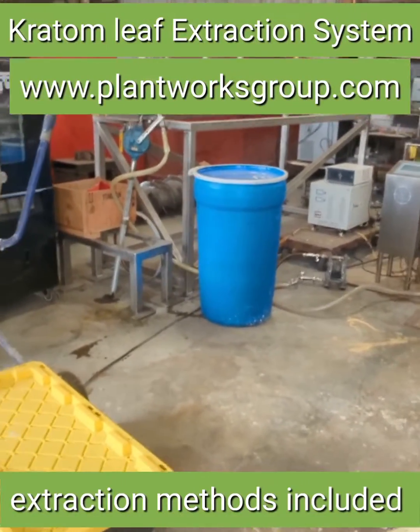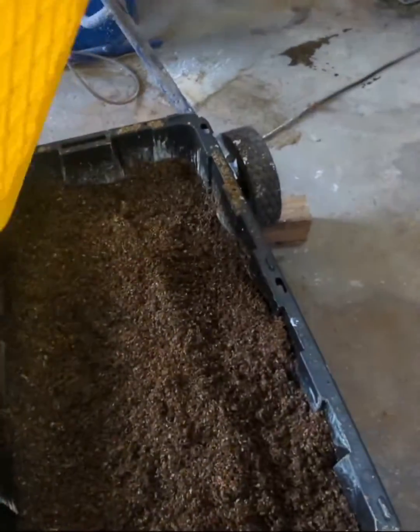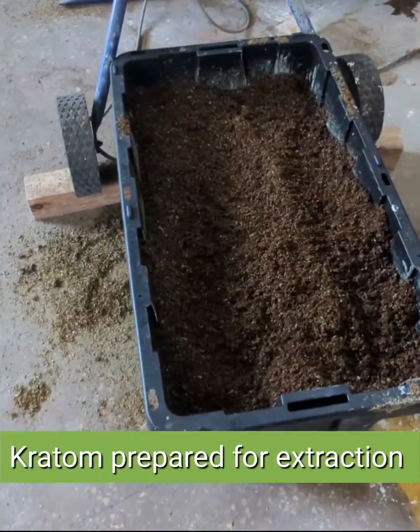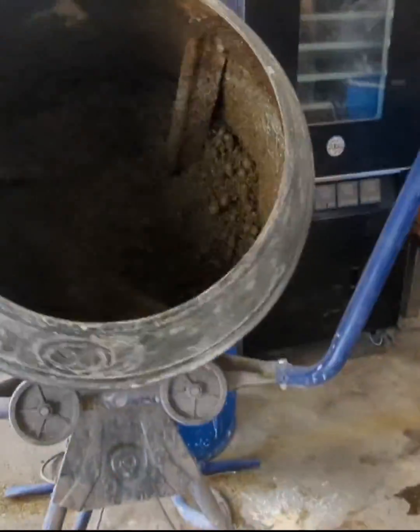Here we have a small batch kratom extraction line, complete with SOP. This is the pre-prepared kratom. I'm also mixing with an exclusive here.